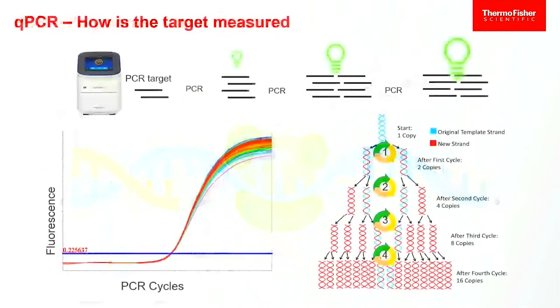All right, so again, we had that twofold amplification process, which is represented again slightly differently on the right. And the difference between PCR and qPCR is up here at the top. We do the cycle.